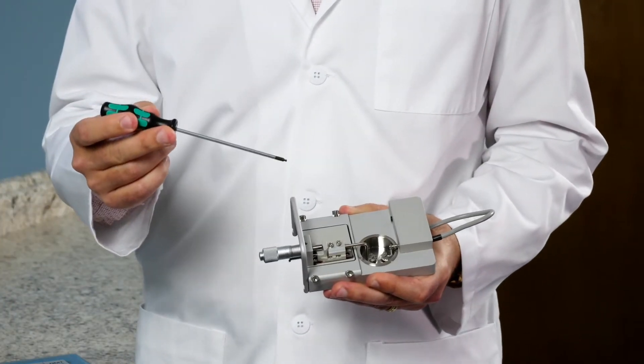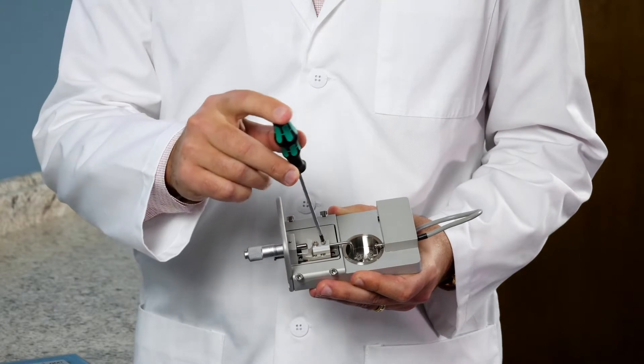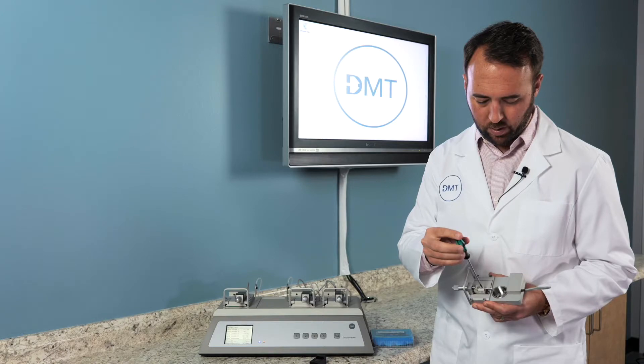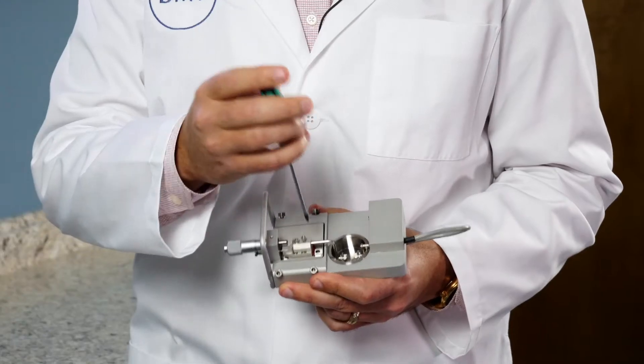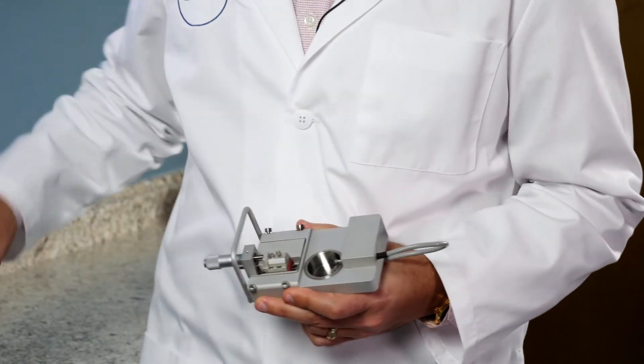use your ball end screwdriver to loosen the first screw closest to the chamber. Loosen that and then you can remove the jaw mount.